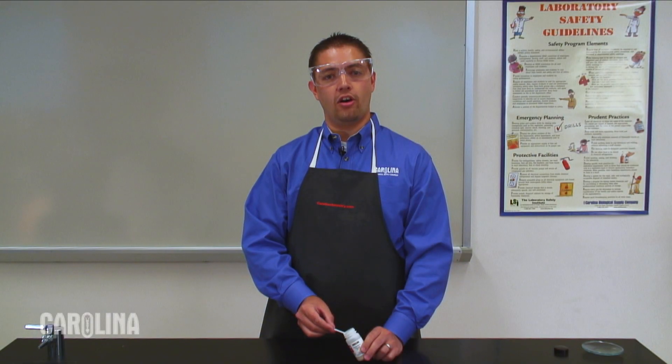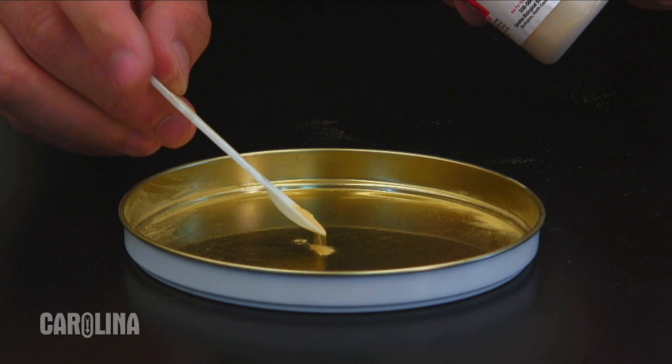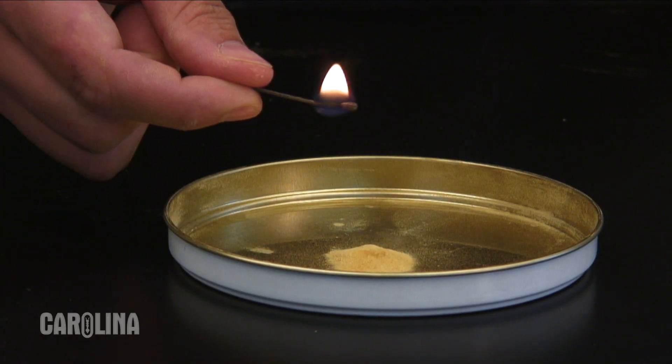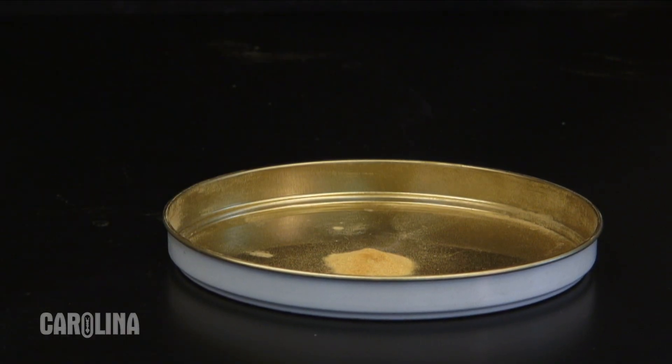First, we'll combine all of the components of our combustion reaction. We'll take a small amount of lycopodium powder, about half a spoonful, and place it in the presence of our oxidizing agent, oxygen. Holding a lit match to the powder, we observe that it burns and rapidly goes out in lack of sufficient oxygen, much like a car requiring an adjustment to its fuel-air ratio.